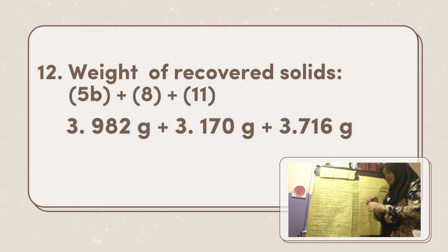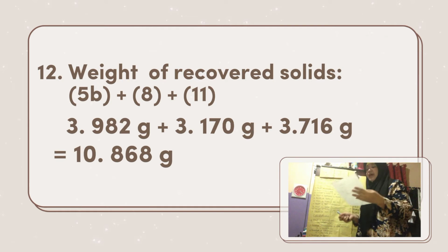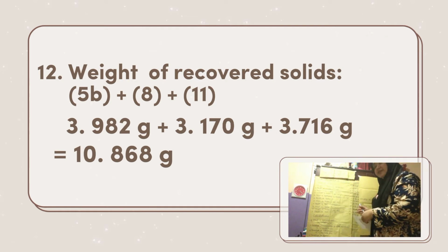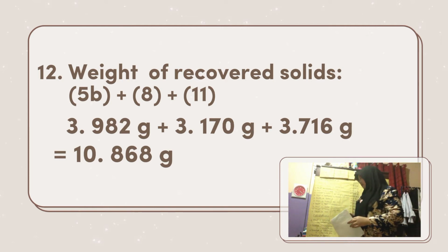The total of this is 10.868 grams. So we have 10.868 grams weight of recovered solids.